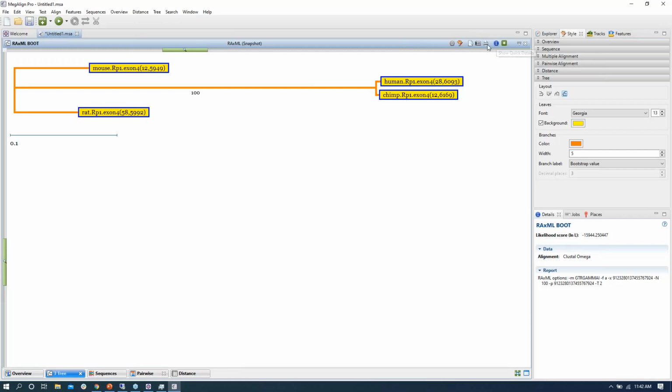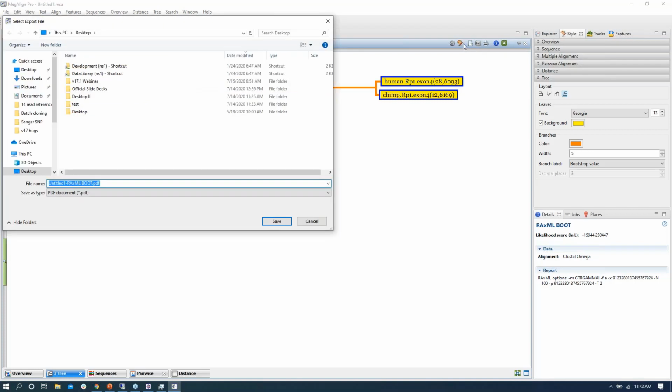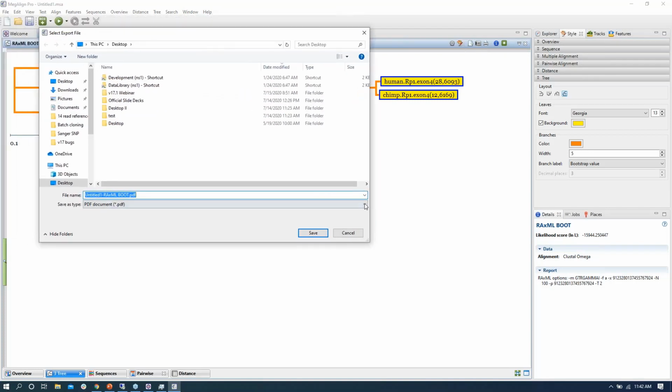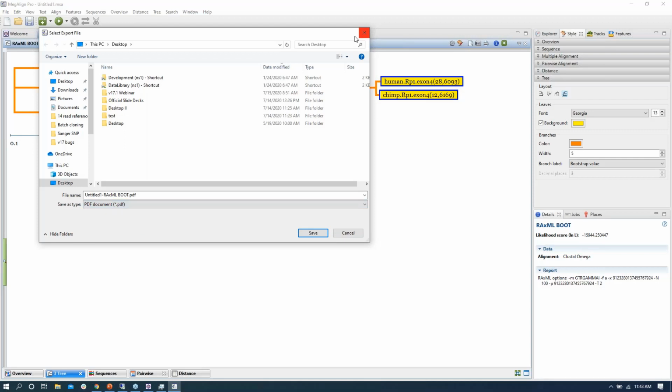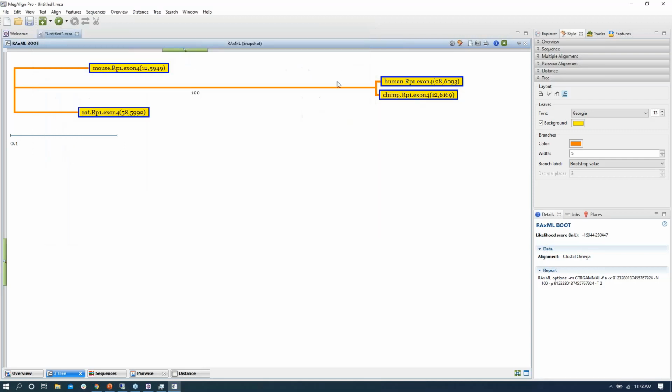Now, there's also the ability to export the image. Once you get an image that you're happy with, with these newer applications, the ability to export to PDF or directly to a PowerPoint or bitmap images is very handy. PowerPoint is nice because the different lines will be identified as objects, so you can make edits to specific lines pretty easily. So it's a nice ability to go right into PowerPoint with that.